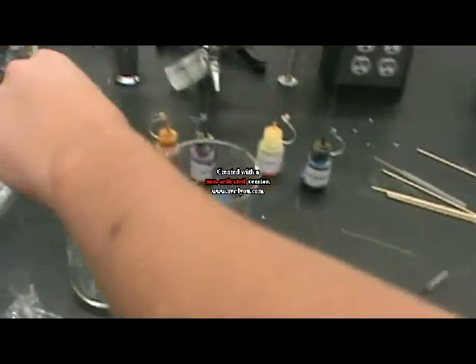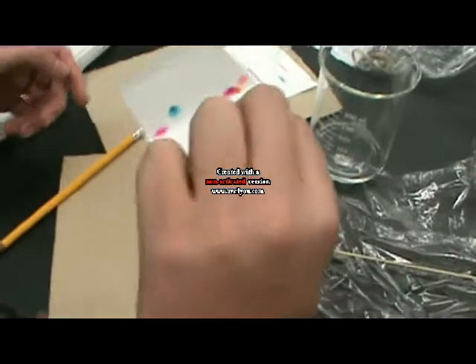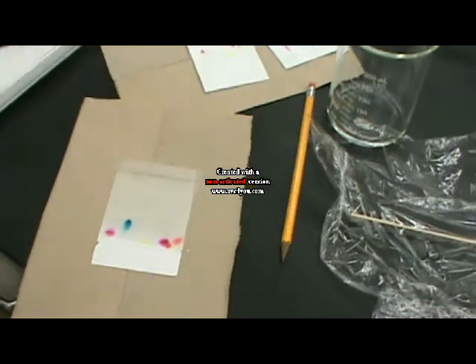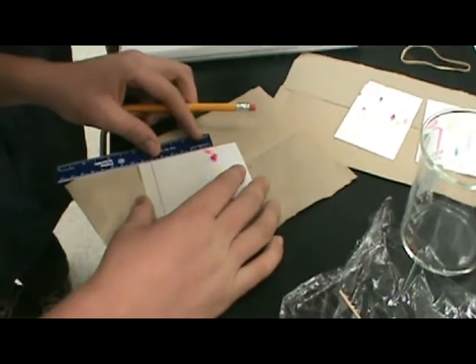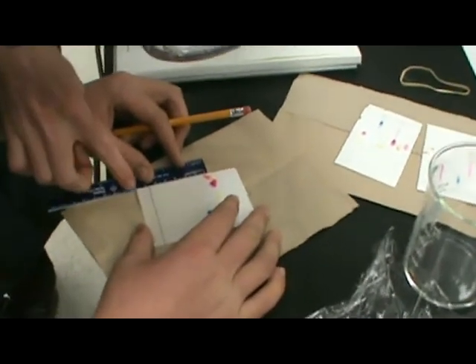Now it's Blake's turn to go through the same rite of passage. Because Blake drew one of the lines for us. So we just measure it all the way from the bottom. As soon as you take it out of solution, you draw a line to mark where the solvent ends.